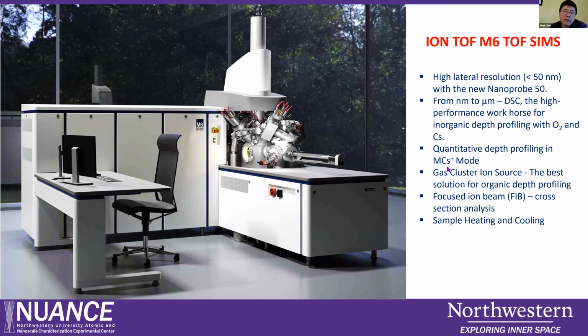We can have many ion sources, including the gas gun. This gas gun, just like in XPS, you just turn on, you don't need calibration, and you can easily do the depth profile. Also for this one, we will have a FIB column. We can make a cross-section analysis. You just cut part of your sample and tilt, and then you can do the mapping.